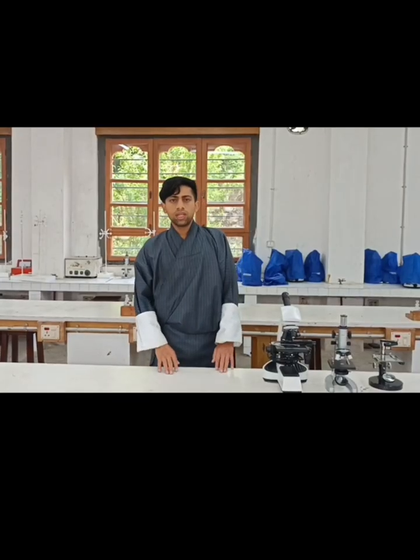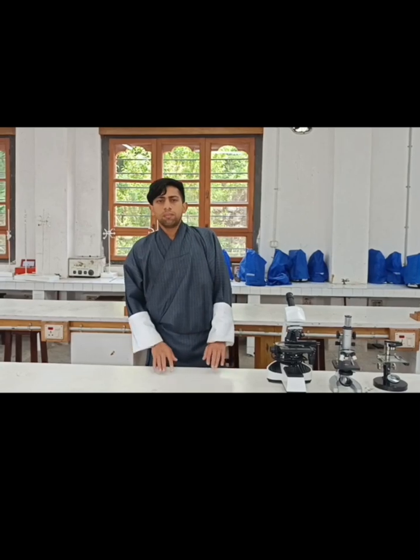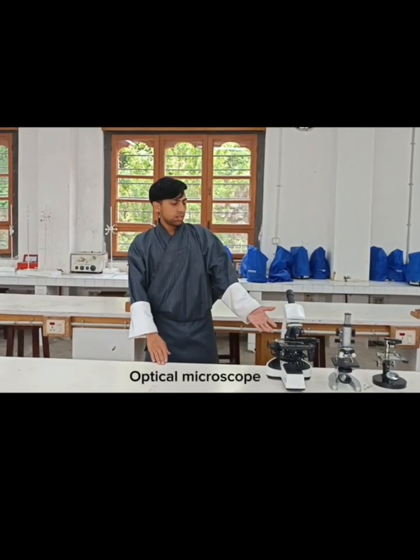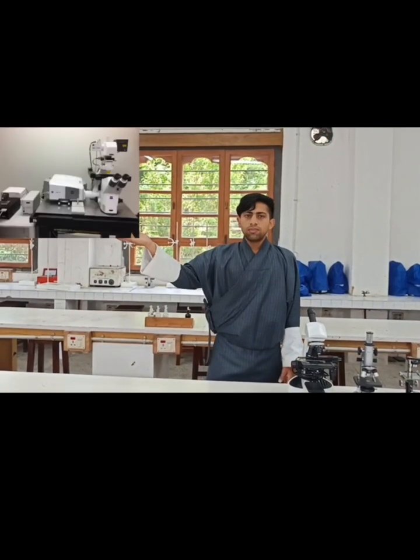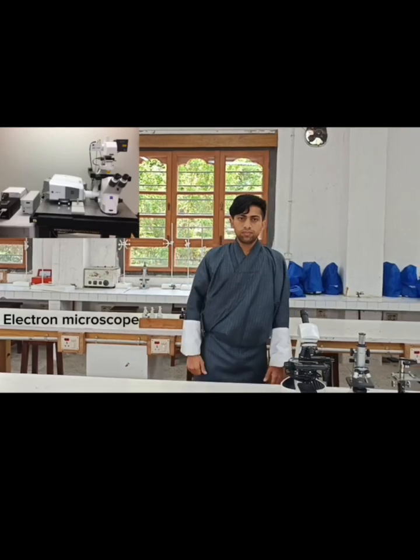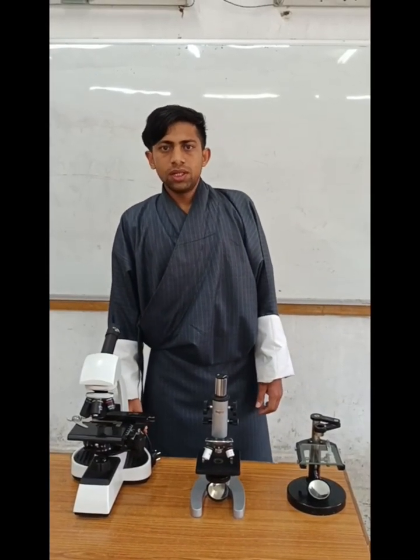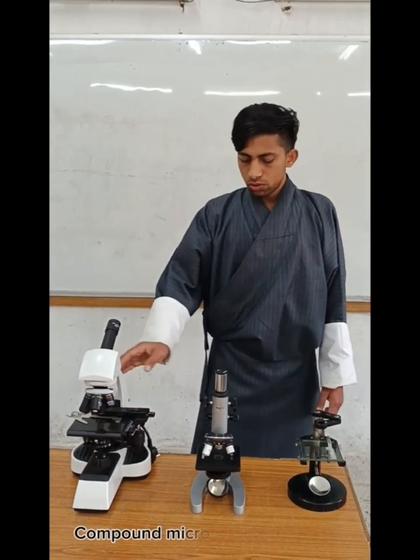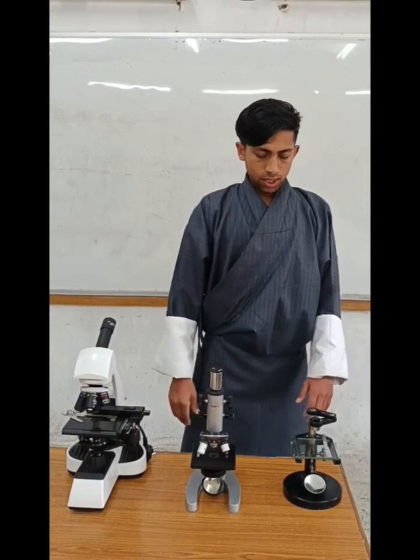We will be talking about types of microscope. Basically, microscopes are of two types, optical and electron microscope. So these are the types of optical microscope and these are the types of electron microscope. To talk about optical microscope, it is divided into compound microscope and dissecting microscope. So these two are compound microscopes and this is the dissecting microscope.